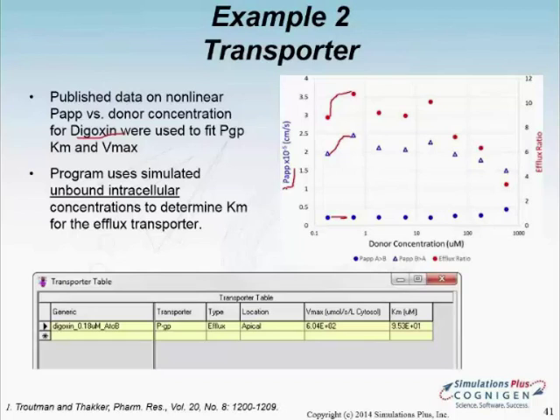Thank you, Viera. Another question. We sometimes observe non-unity efflux ratios for passively fluxing compounds like mannitol, presumably due to some experimental artifact. Does MembranePlus ever show a similar trend? One of the aspects, actually, I'm not sure if we've explored this in detail. Maybe Kay or Jim would have to chime in on this one, if we had enough data to actually explore that kind of differences.